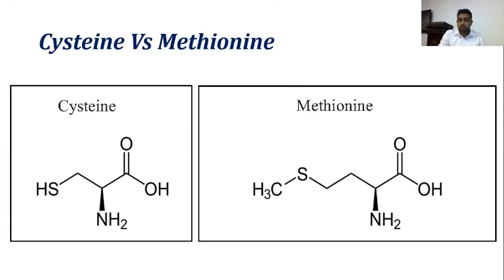As you are aware by now, we have discussed a few qualitative tests for proteins, the coagulation test and the precipitation test, both very simple kinds of tests. After that, we moved on to colorimetric experiments, or reactions which give colors. First we discussed the biuret reaction. In the biuret reaction, peptide bonds can react with Cu2+ ions in an alkaline solution and give a purple color coordination complex. In the xanthoprotein reaction, amino acids containing aromatic groups can react with HNO3 and get nitrated and form nitro derivatives. And after adding excess sodium hydroxide, it can turn into a deep orange color.